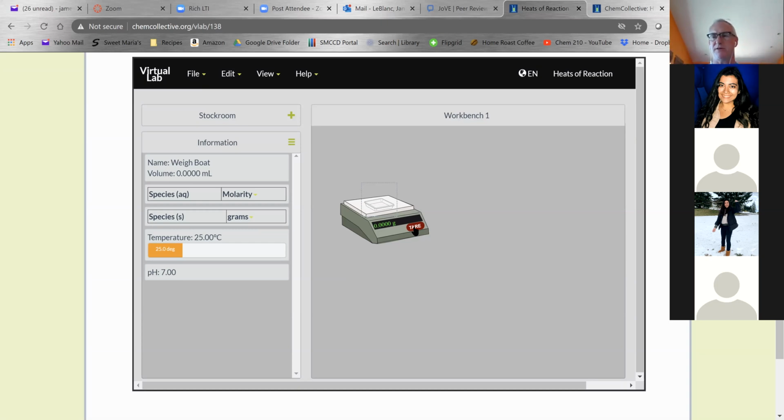Just different amounts. Basically what we want to see is you're able to figure out what delta H reaction means. So if you use different amounts and you still come out with the same delta H reaction, then you understand how to calculate it. If you don't, then there's something wrong. That's sort of what we're looking for. So if I use 0.5 grams of NaOH, can I use 25 ml of the solution? Should be able to.